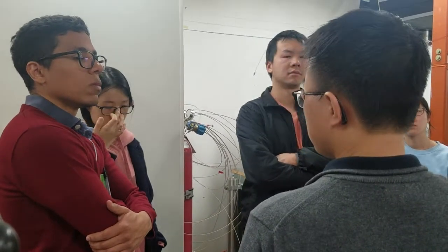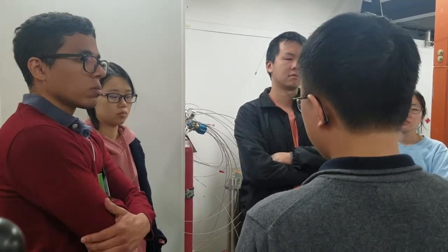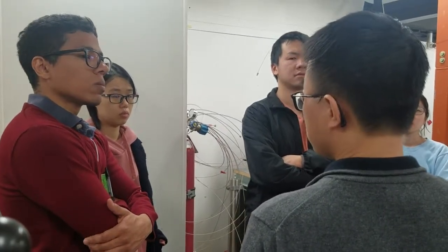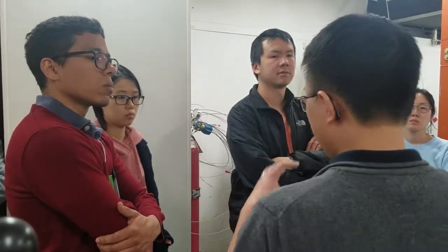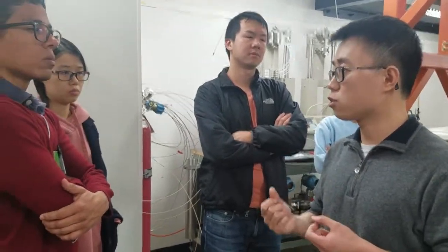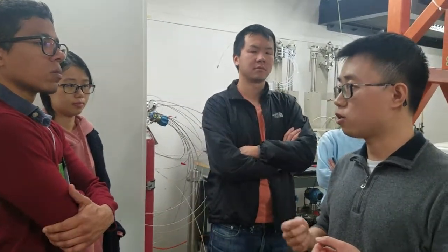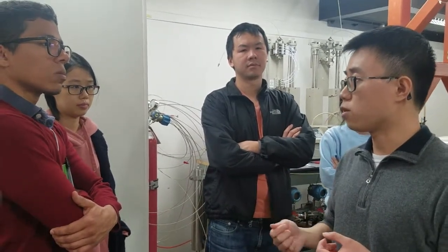But in case you want to do 3-phase core floods, you need to do a dual energy scan. That means you need to scan at 2 different energies in order to get saturation of 3 different phases. Because right now you have 2 unknowns, so you need 2 equations to solve it. But for the microCT, it's different. As long as your target phases have very different X-ray attenuations, you can differentiate them in a single CT scan. Let's say you have oil, you have gas, and you have grain. Then you can easily differentiate these 3 phases using just 1 scan.